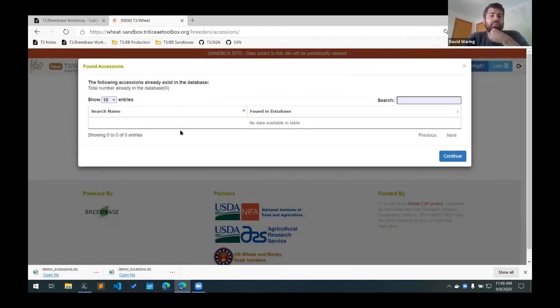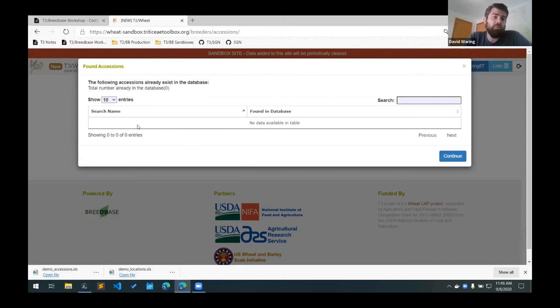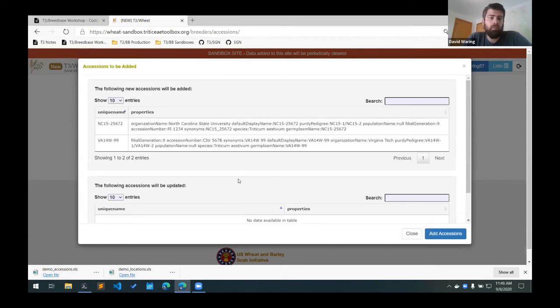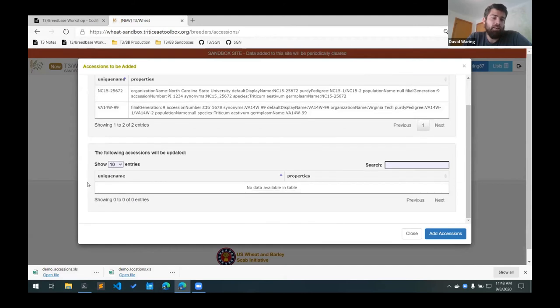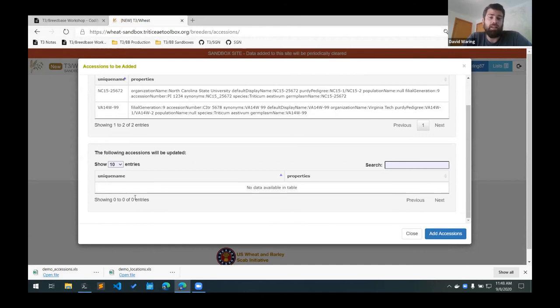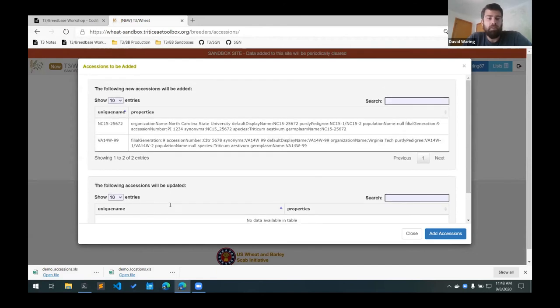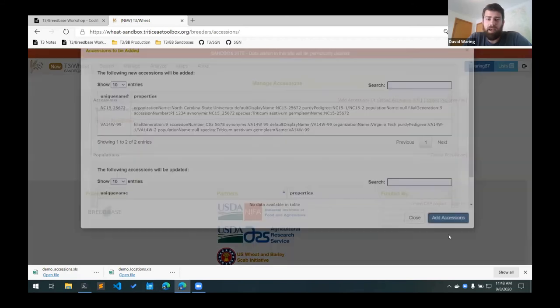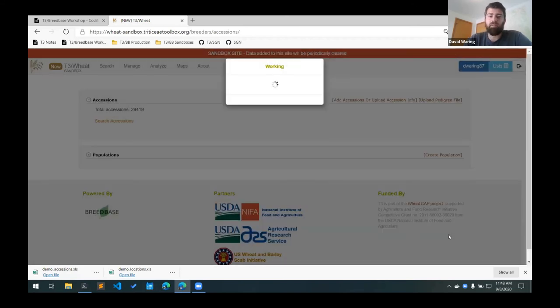And this will check to see if the lines already exist in the database. So what this is saying is that these two lines don't exist in the database, that there aren't any matches. And it says that these two lines will be added. If they did exist in the database, it would have the lines that will be updated down here. We just have two new lines and their properties listed here. Click the add accessions button and they will be added to the database.